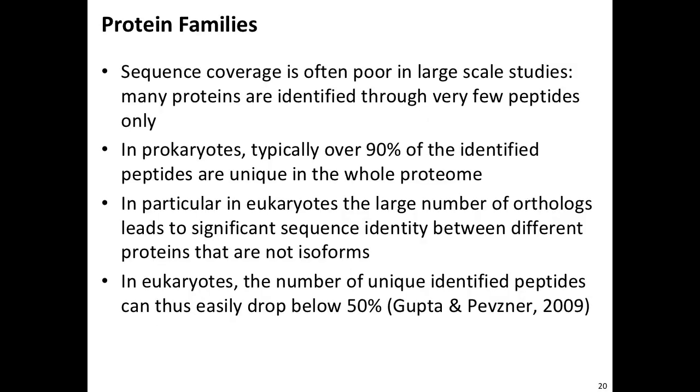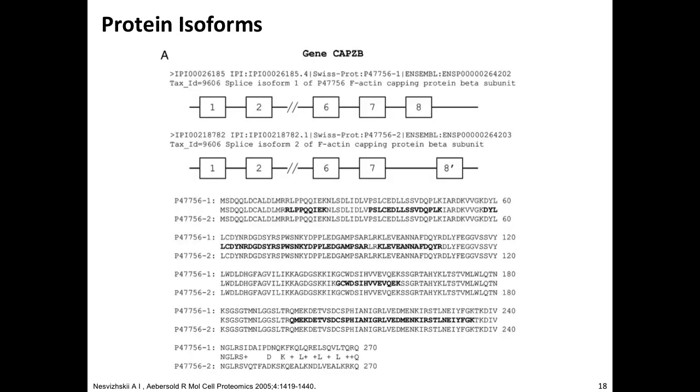So what that gives rise to is this notion of protein families. The problem really is we should not imagine that we see the whole sequence covered. In reality, something like this here is more frequent. Highlighted here in black are all the peptides that were actually observed in a sample that contains this gene. That is what we call protein coverage. You should not imagine that you really see a peptide for each of these subsequences. So why not? What happens to the other peptides? Why is this guy not there, this guy?